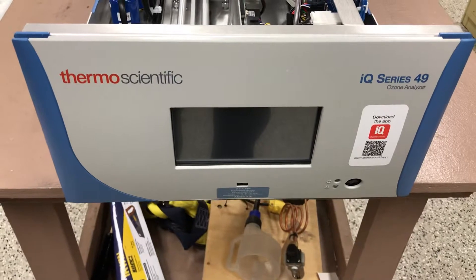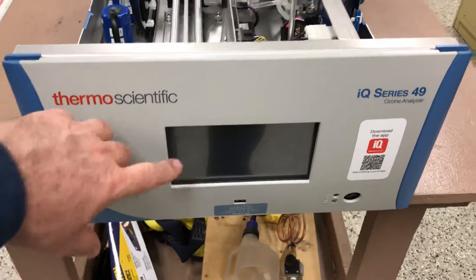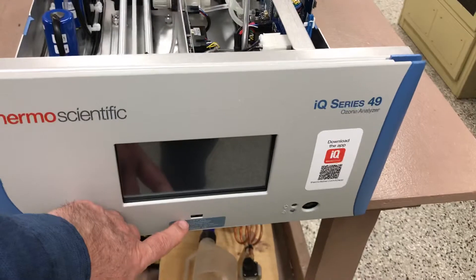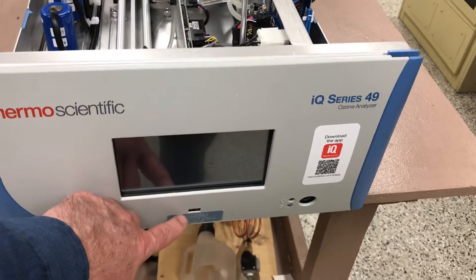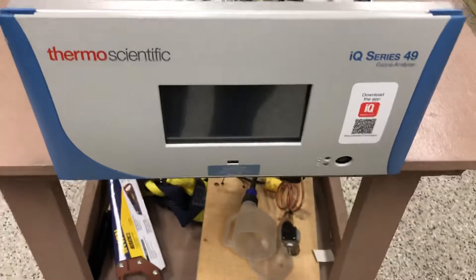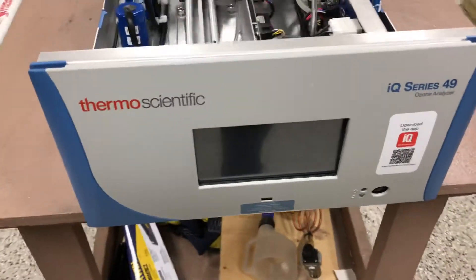As with the other instruments I've been posting, this has a centered touchscreen with a USB port at the bottom for easy access to the data. It's a thumb drive again in here just to pull off the data, and you can still use a laptop if you want to do that as well.